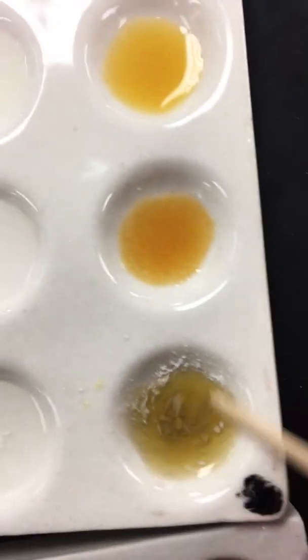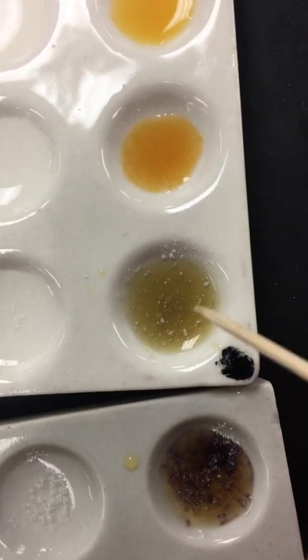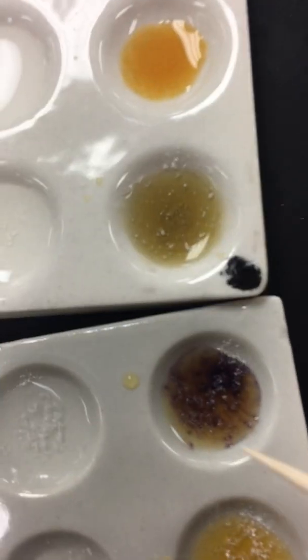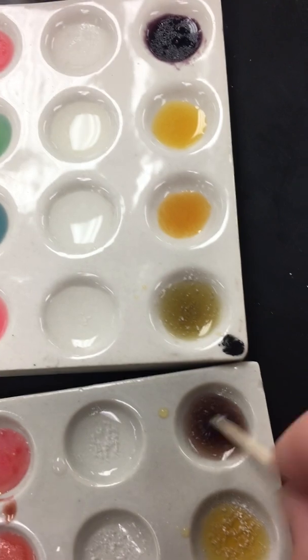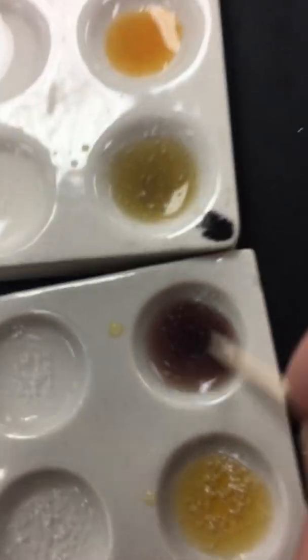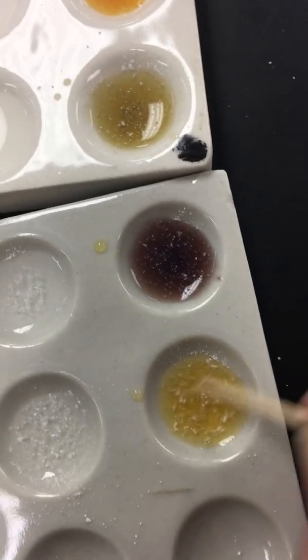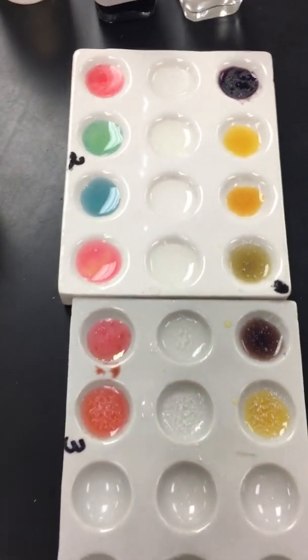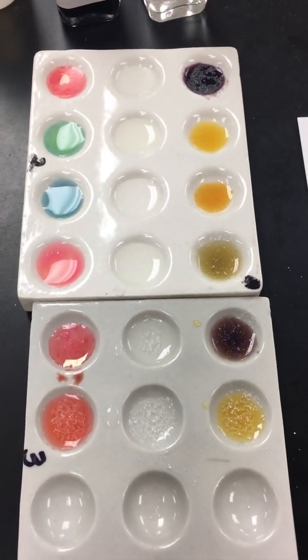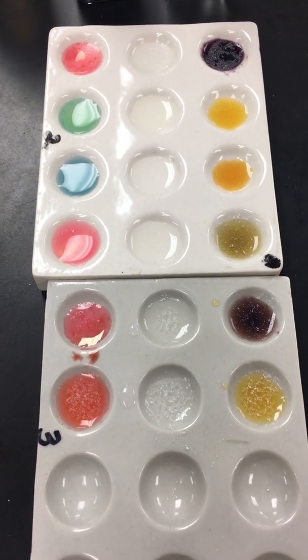And then we have acetaminophen, which kind of is a yellow, I don't know, green maybe. And then we have Excedrin, which is turning sort of that purple again, but not as deep, kind of an orangish purple. And then we have ibuprofen, which is staying more of this yellow on top. So there are our knowns right there: aspirin, Alka-Seltzer, sodium bicarbonate, acetaminophen, Excedrin, and ibuprofen.